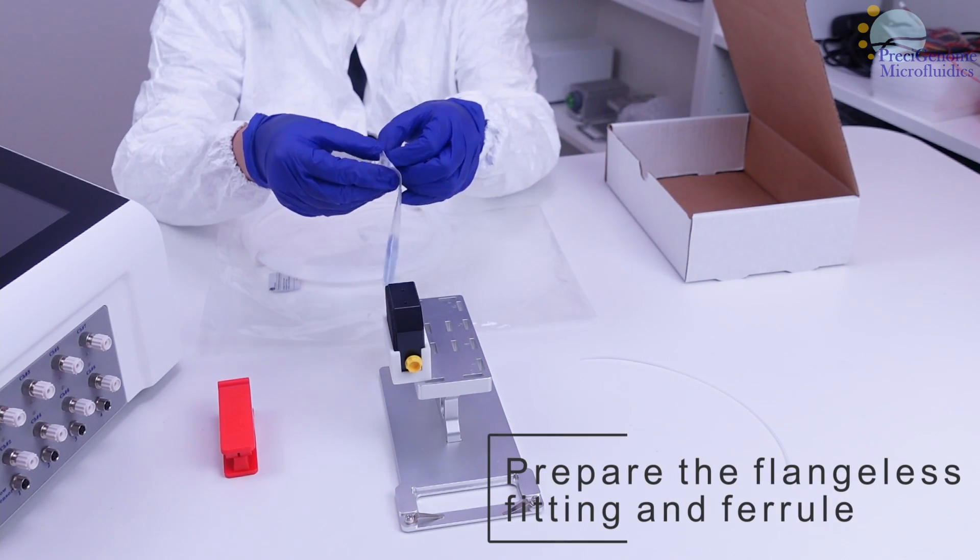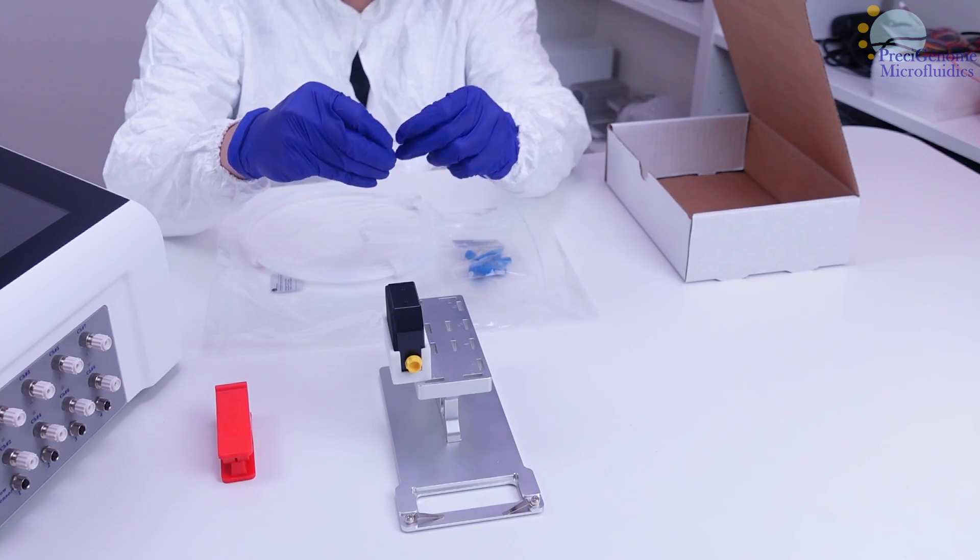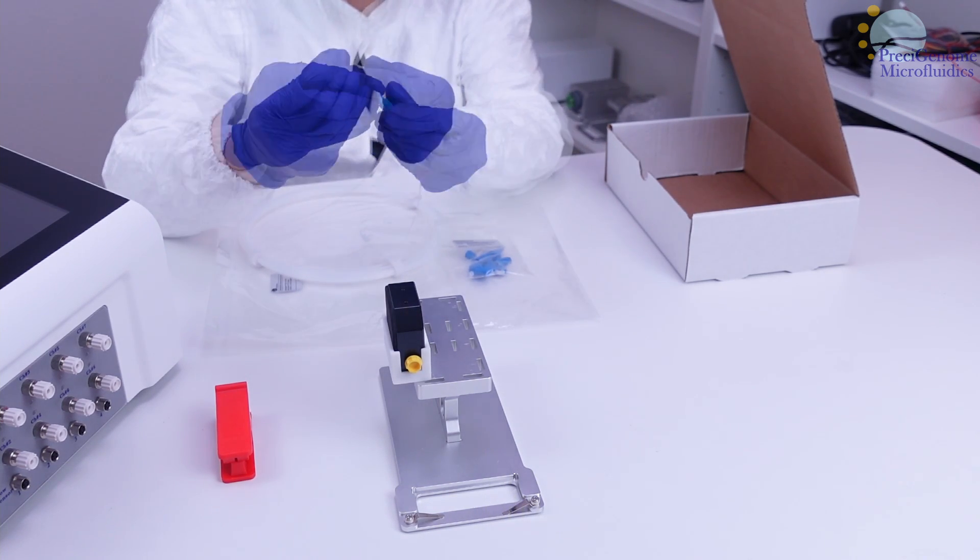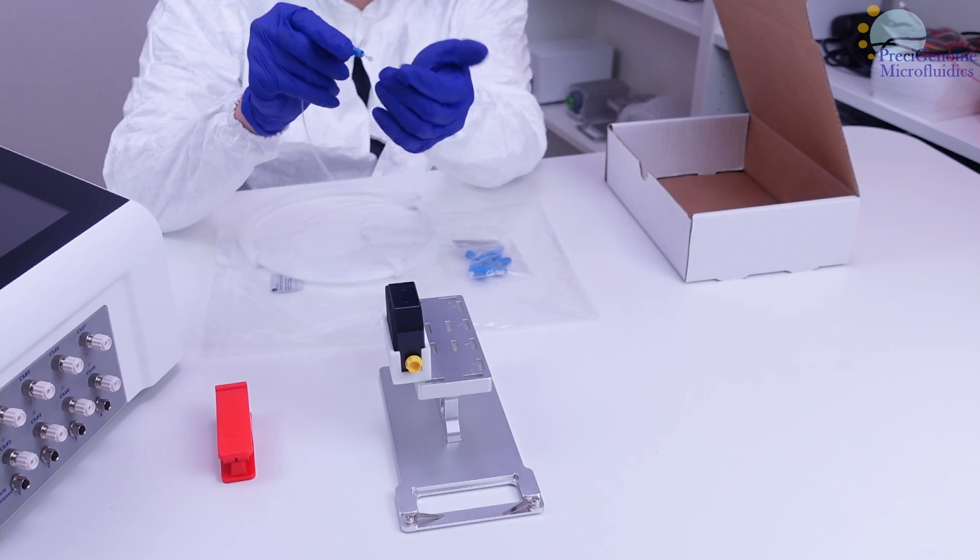Also take out a flangeless fitting and ferrule. Slip both components onto the tubing, and ensure both have their narrow ends pointing inwards.